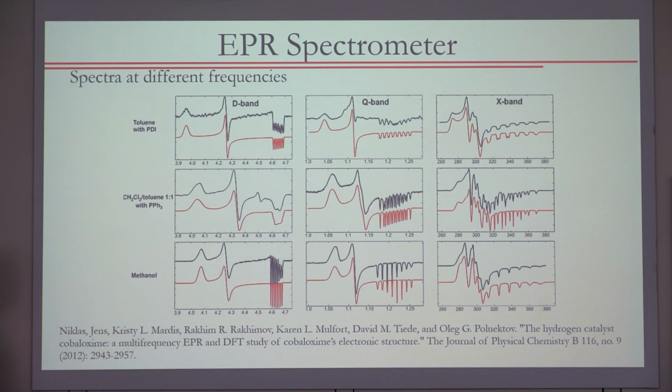These are other examples of the same, the same compound in different solvents. So you can use this for some things, but it's not a magic solution for everything to have a higher frequency.